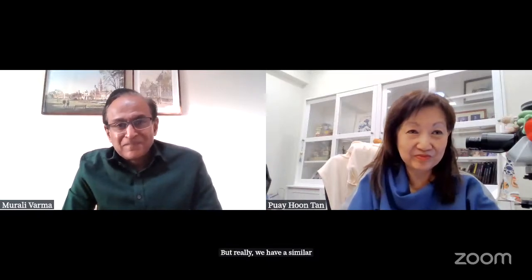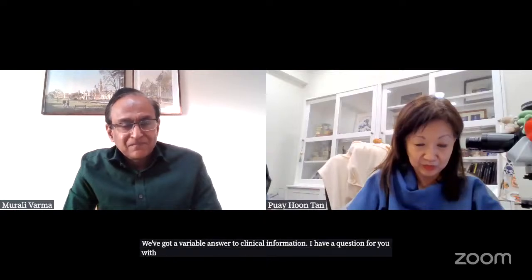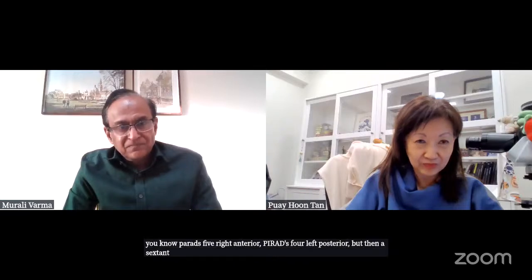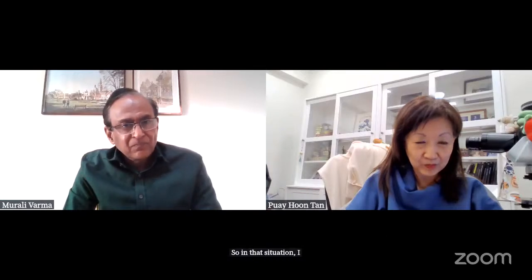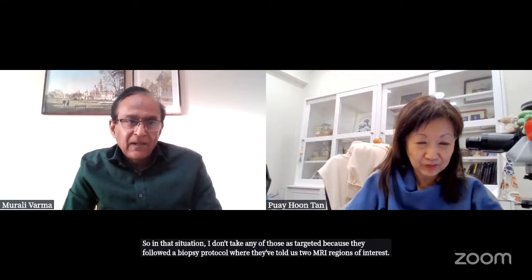So Murali, we have a similar situation in Sheffield where we're quite lucky, and the urologist will tell us how many cores we get. We get a variable amount of clinical information. I have a question for you with your approach. We will often get MRI reports on the front that will say, PIRADS 5 right anterior, PIRADS 4 left posterior, but then a sextant biopsy protocol. So in that situation, I don't take any of those as targeted because they followed a biopsy protocol, but they've told us 2 MRI regions of interest. How would that fit with your approach?